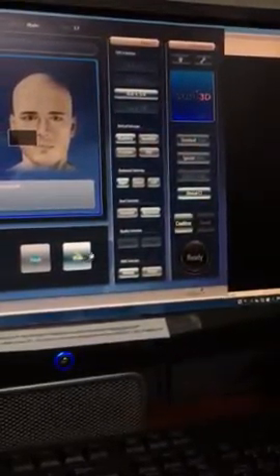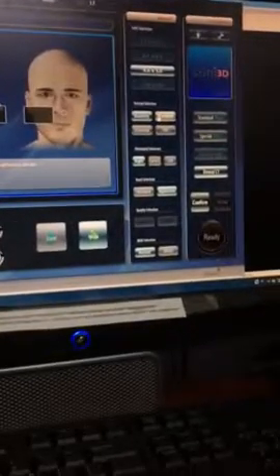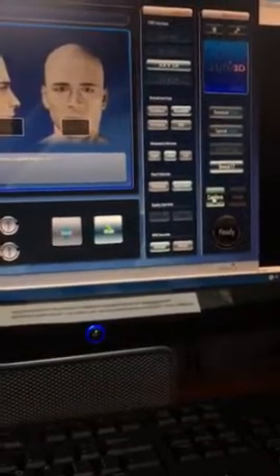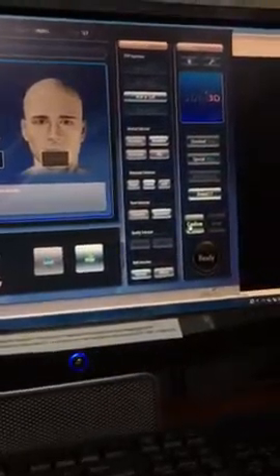I'm going to take just an image of this seal tooth that I found in Half Moon Bay a long time ago. We'll do mandible, it's going to be lower, we'll do center, and we'll click confirm. And now the same thing.